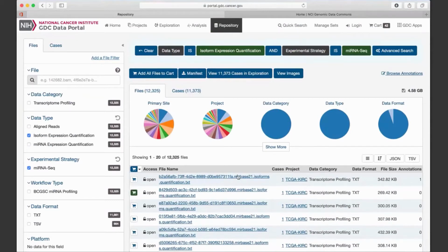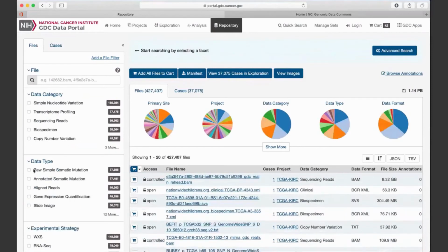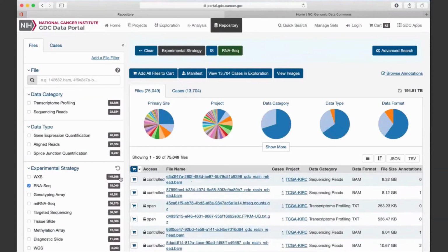Oh, the mRNA, not currently. All the quantification is based on the gene level that HT-Seq and STAR both provide. We are thinking about adding another pipeline that can quantify isoform expression. But if you are interested in doing it yourself, my suggestion is using the RSEM tool for a particular input.